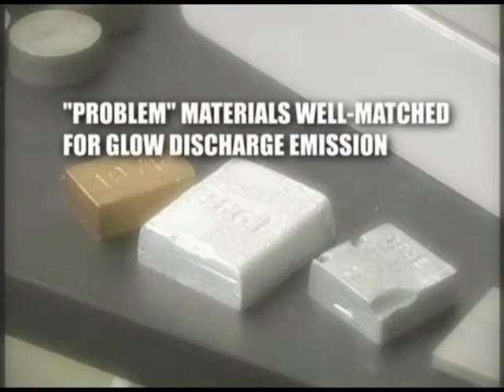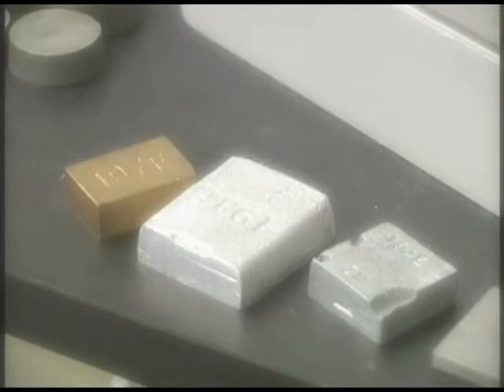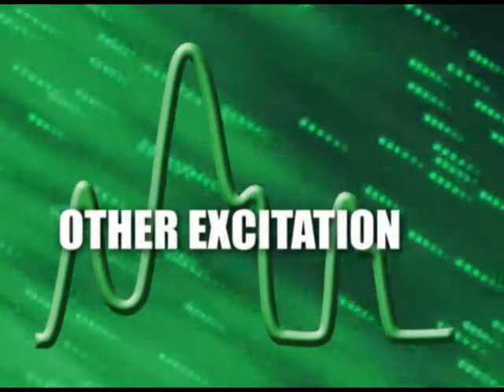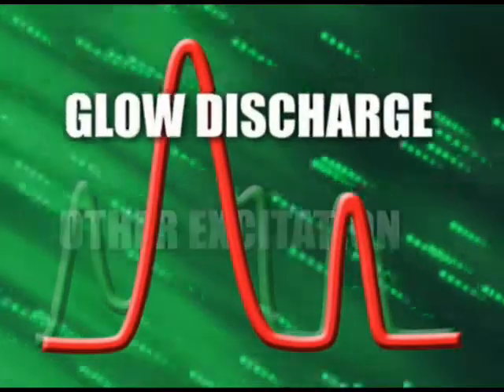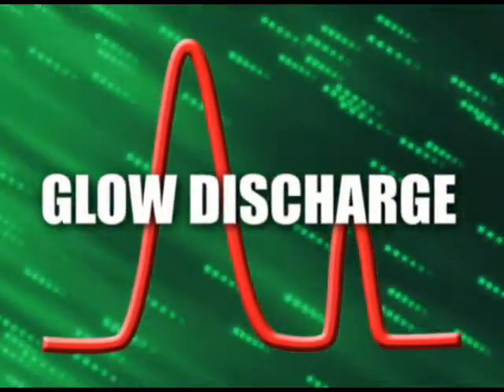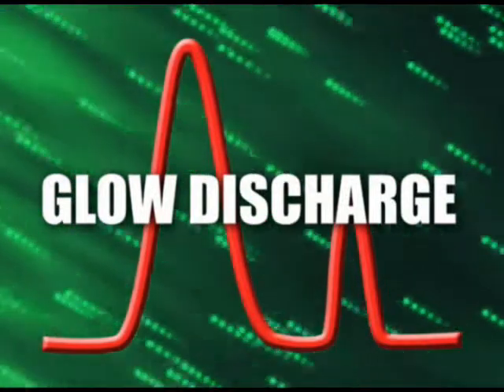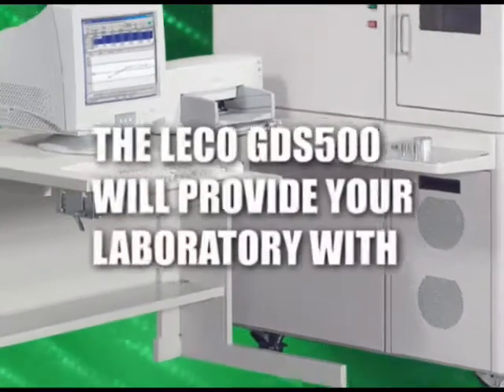In addition to typical ferrous applications, many problem materials are best measured by the GDS500 compared to other methods. Stainless steel and other high alloy materials create intense nickel and chrome interferences. The glow discharge source reduces these interferences and allows the proper analysis to be performed.